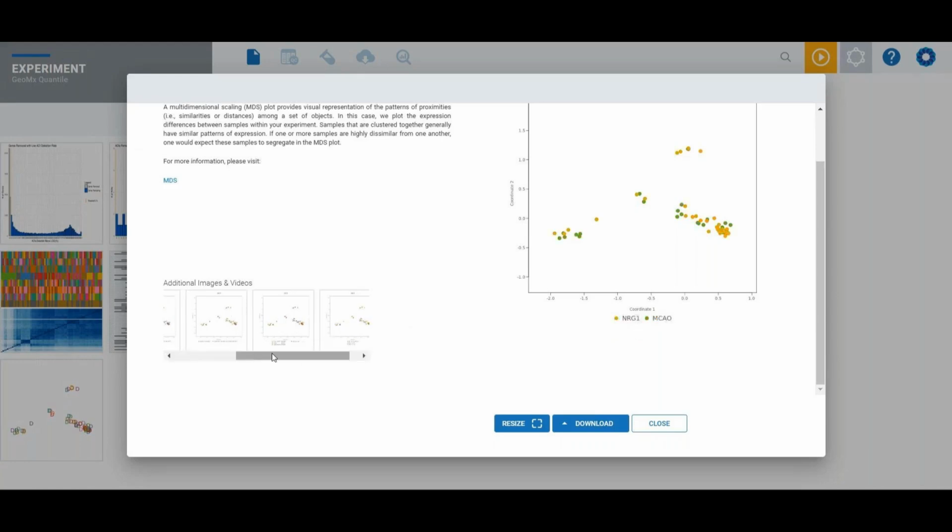I don't think I have it on here, but these were actually taken at different time points. What we showed is that at 3 days post-stroke, we had a high differentiation in each of these regions, but at 7 days, there was less differentiation of the different regions. These are helpful in quickly looking at your data, showing any similarity, and confirming your models. So this is a really helpful graph to see.